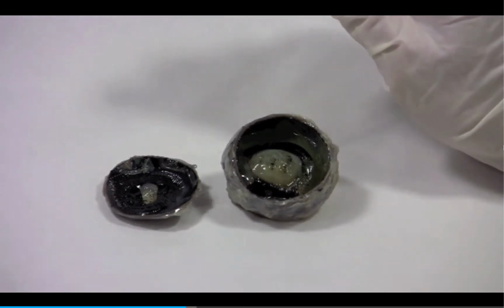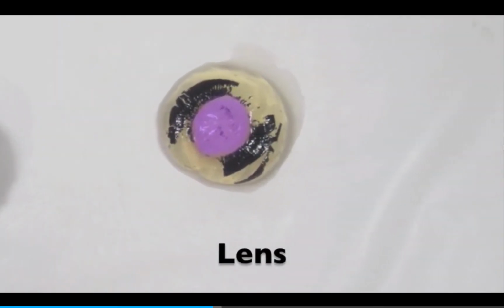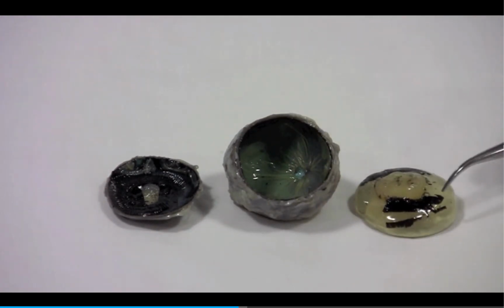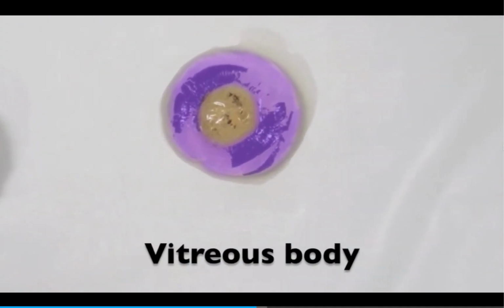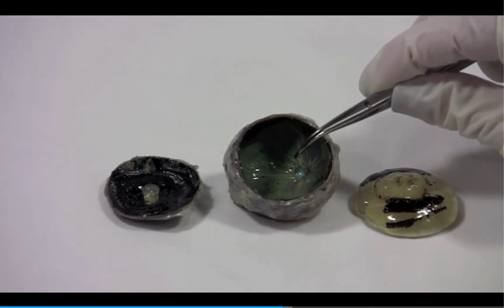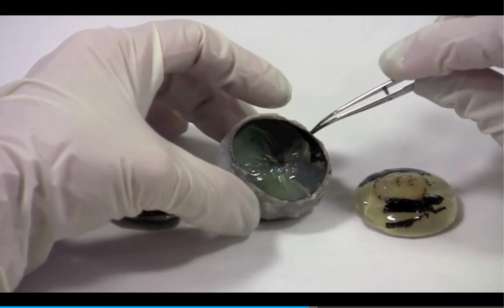Taking a look into the posterior half of the eye, this object is the lens. You can see that the lens is attached to a gelatinous sac. That's called the vitreous body. The vitreous body fills the posterior segment. It's in contact with this delicate yellow membrane. That's the neural layer of the eye, known as the retina.